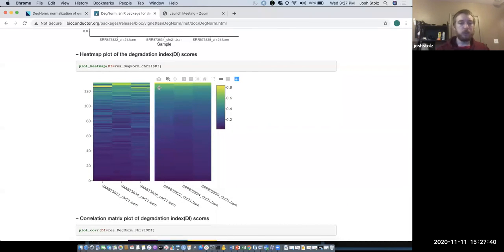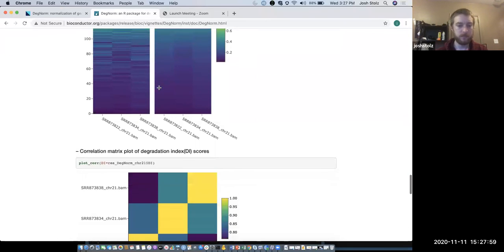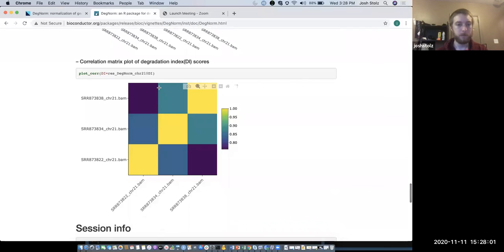And again, you can get some box plots here of the degradation integrity index. And on this last one, I'm not sure what the Y index is, if that's like a histogram of how many genes fall into each bin. But you can make a heat map of the DI and cluster the genes accordingly. This would show if the degradation integrity is similar across all your samples.